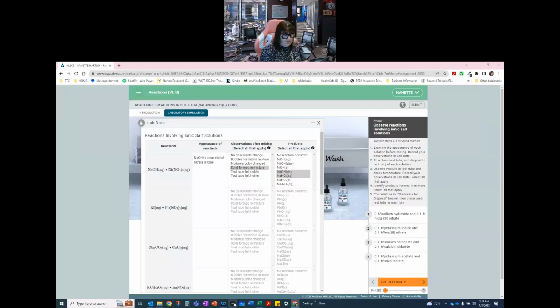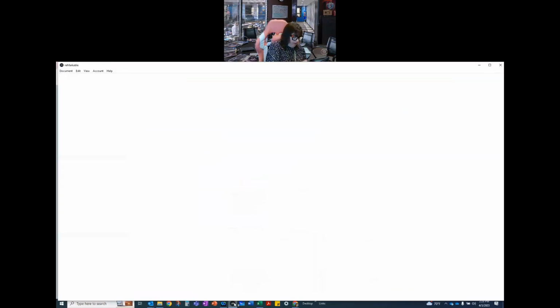So I'm going to go ahead and open a piece of paper and let you guys look at this.